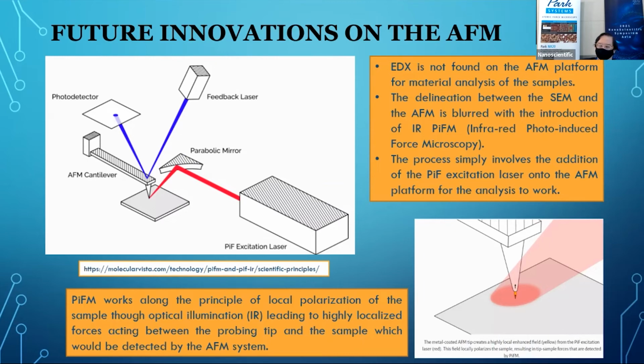The idea is that because the beam is at the tip, basically just a regular tip of an AFM, there is a very narrow region where, using the light, they're able to excite the surface with photons, and make the detection in terms of a force, as in typical AFM measurements.